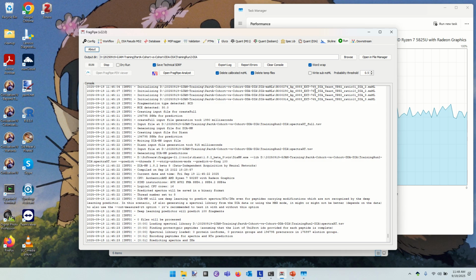If I have a sample showing 0 intensity just before, and then a quickly rising intensity, and then I can track its fall off with another 10 measurements, that's brilliant. But the more times I sample this, the fewer the number of isolation windows I can consider. So there's always going to be a trade-off in our method development to try to keep the windows of isolation narrow enough that we're not trying to quantify 100 peptides at a time in a single scan, but see them frequently enough that we can get time resolution on its intensity profile.